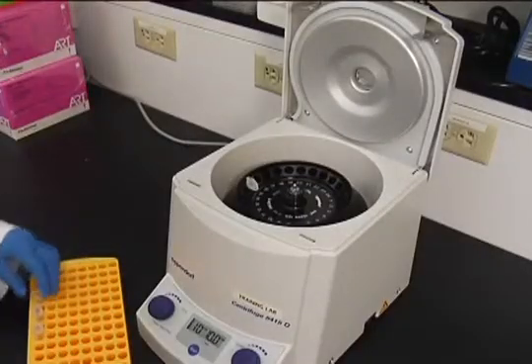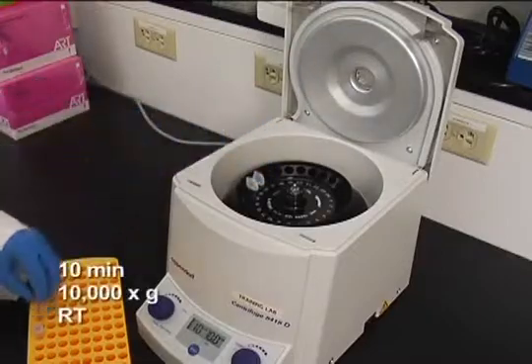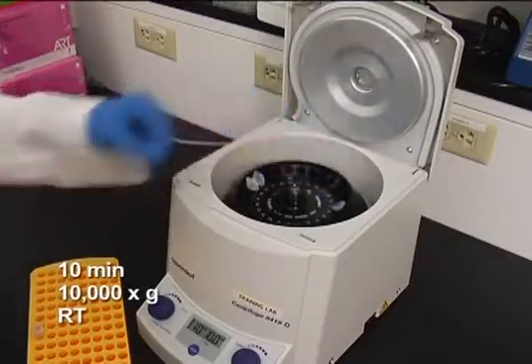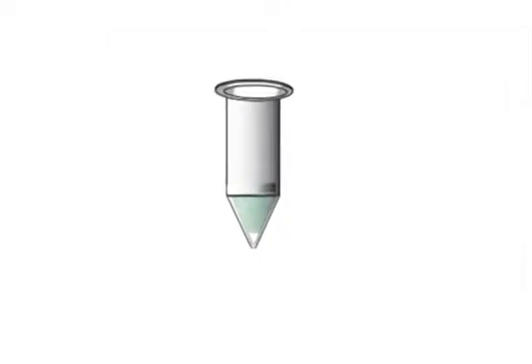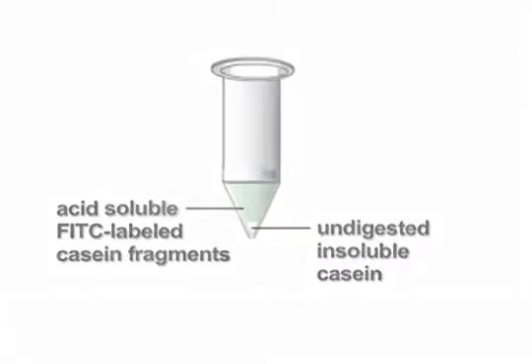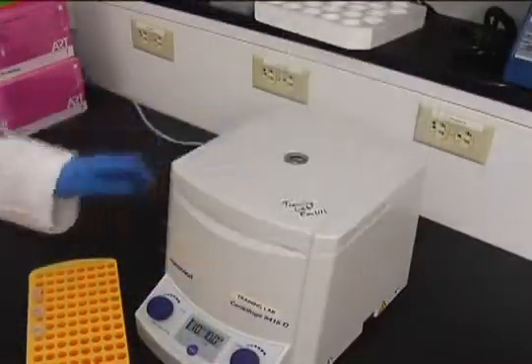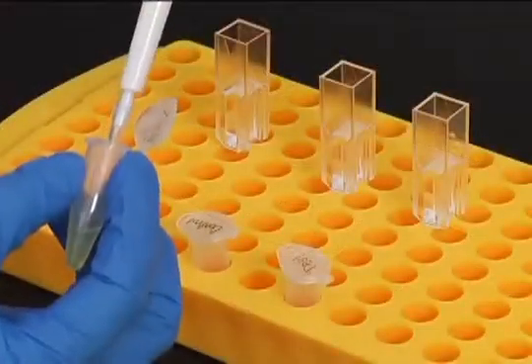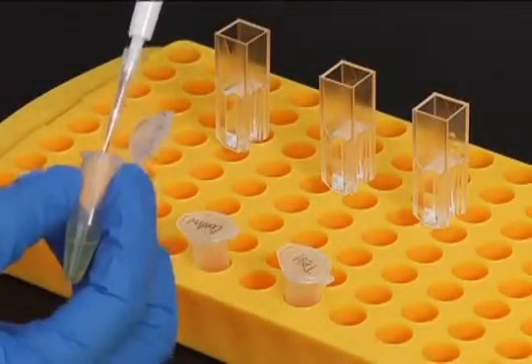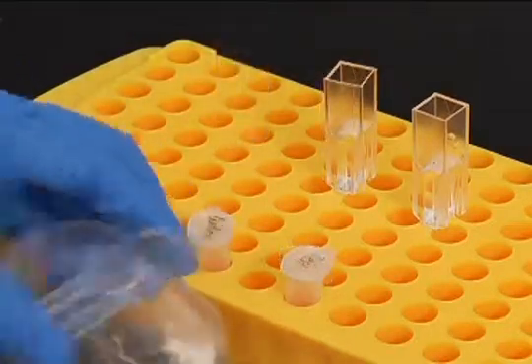At the end of the incubation with the TCA solution, centrifuge the tubes for 10 minutes at 10,000 Gs at room temperature. The supernatant contains the acid-soluble, FITC-labeled casein fragments used for the fluorescence measurement. Pipette gently from the top of the tube so that none of the precipitate in the pellet is drawn into the pipette tip, which will cause a false positive readout during the following fluorescent detection.